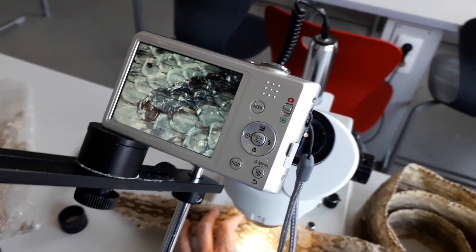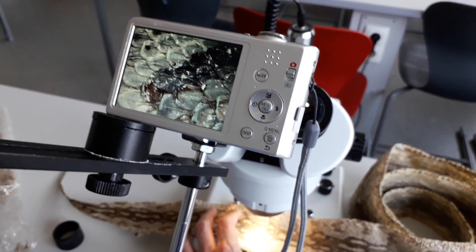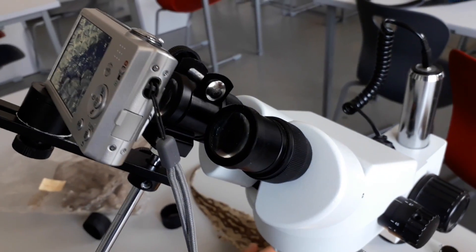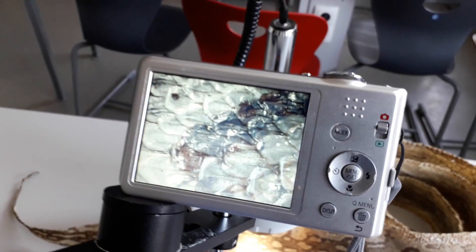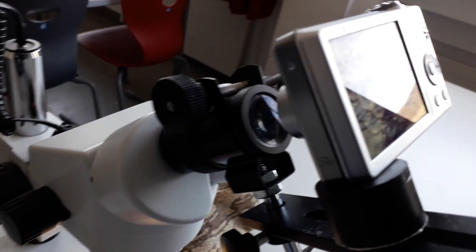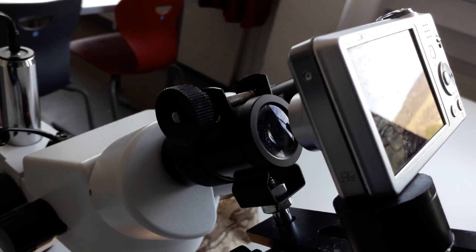Everything's now set up. I'm getting a live image using so-called afocal photography, which means taking a picture directly through the eyepiece of a microscope. That's what I see now - the snake leather. It looks quite magnified, and you can see the individual scales of the snake.